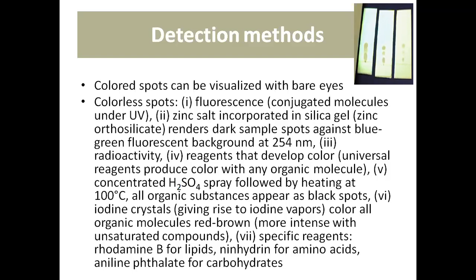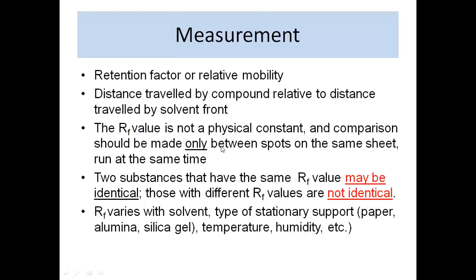ओके, त्याच्यानंतर आपण ऑलरेडी बघितलं की अमिनो ऍसिड जर आपल्याला पाहिजे असतील TLC प्लेटवर, तर then we can use a reagent called ninhydrin. ओके, so all the amino acids will be stained. ओके, पिंक कलर, पिंक और व्हायलेट असा कलर आपल्याला दिसतो प्लेटवरती. There are some exceptions. Proline for example will appear yellow in color. ओके, प्रोलीन जर आपण वगळला तर बाकीचे सगळे अमिनो ऍसिड जे आहे ते आपल्याला पिंक कलरचे दिसतात. Pink to violet color spots are seen on the plate. ओके, असे हे वेगळे वेगळे एक्झाम्पल्स इथे मी दिलेले डिटेक्शन साठी.